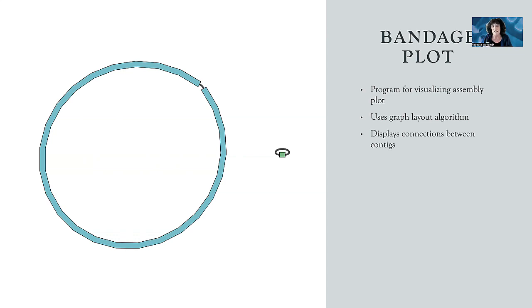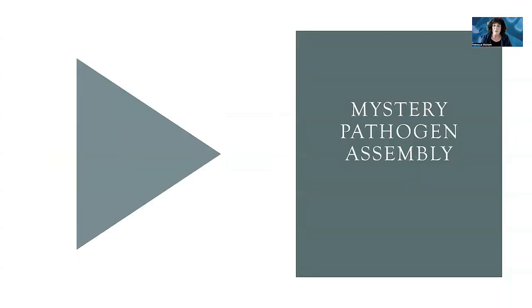It looks like it has 2 contigs. Most of them don't look that way, especially when it's your data and you really care about it. Often it's pretty messy. So I thought I'd just show you what a nice one looks like. You're going to be disappointed to see what they normally look like anyhow, but this is something they can aspire to.